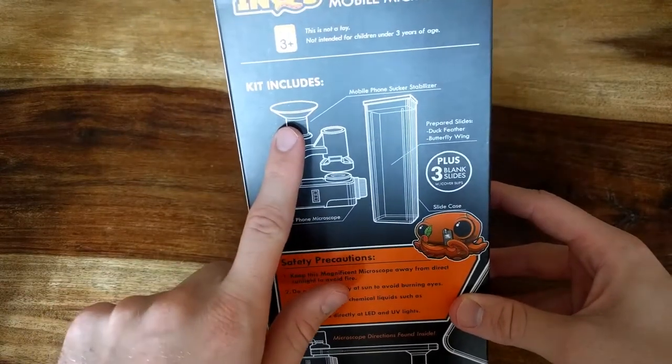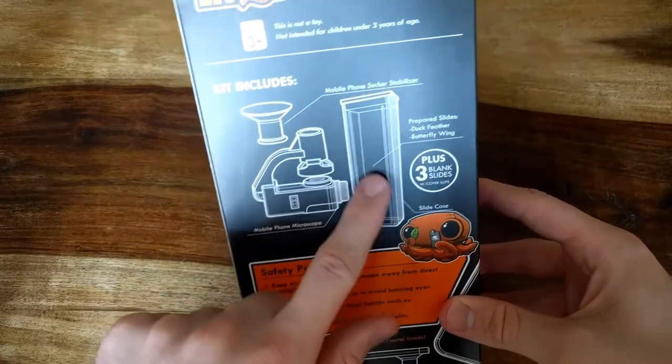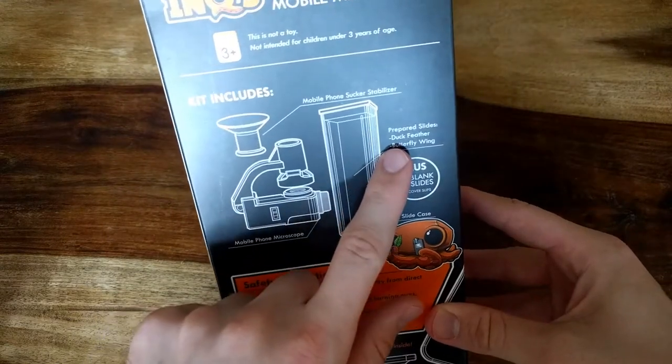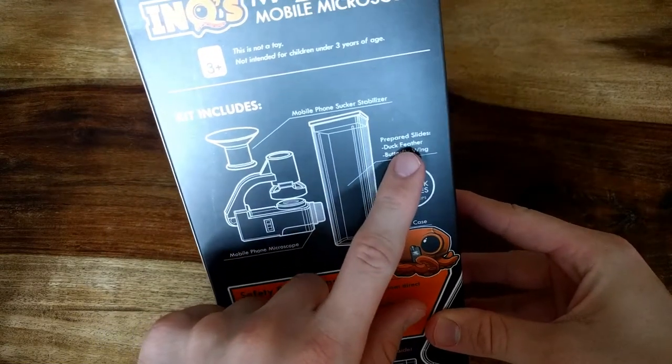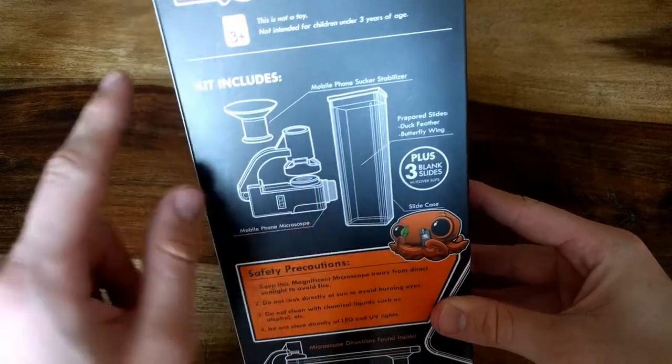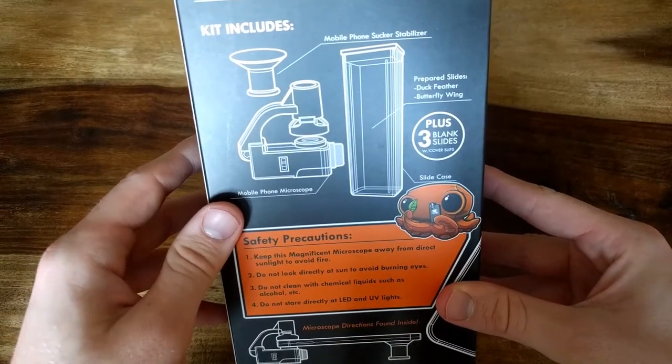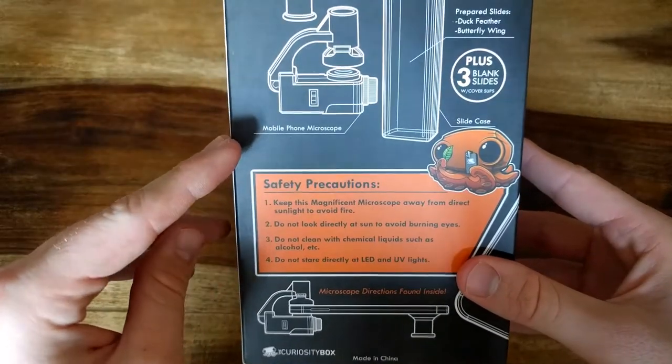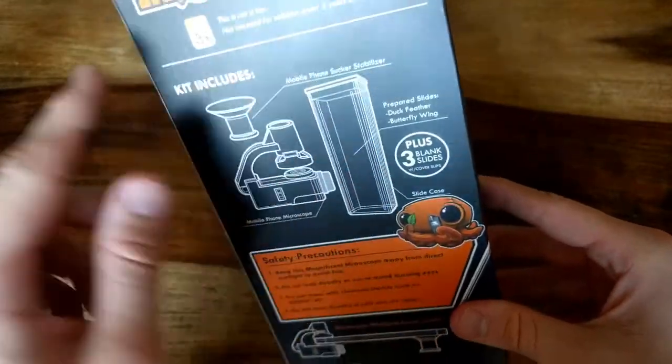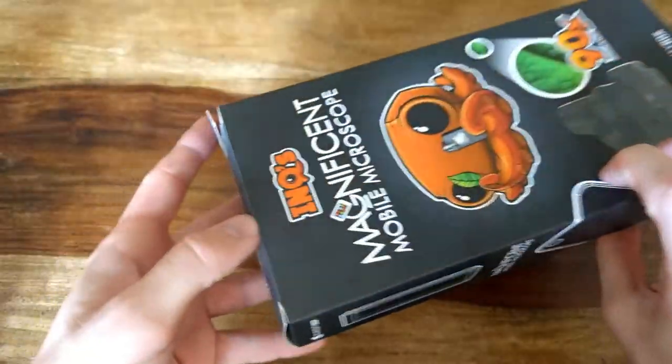These are some samples. It actually has two samples: duck feather and butterfly wing for you to check, and some other blank slides for you to look at. So I already opened it, as you can see.